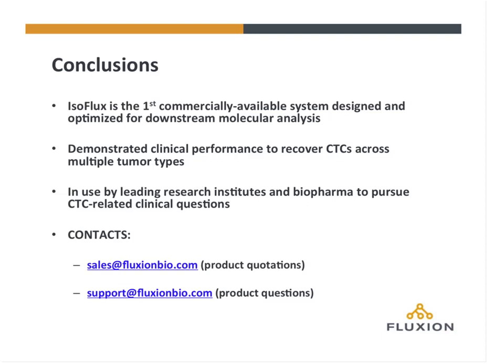The flow is controlled in our microfluidic channels in such a way that the shear stress acting on the cells is very minimal, and certainly no more than it sees in the vasculature. So the cells are viable and should be available for any kind of downstream in vitro culturing or functional assays, as I think this question is referring to.